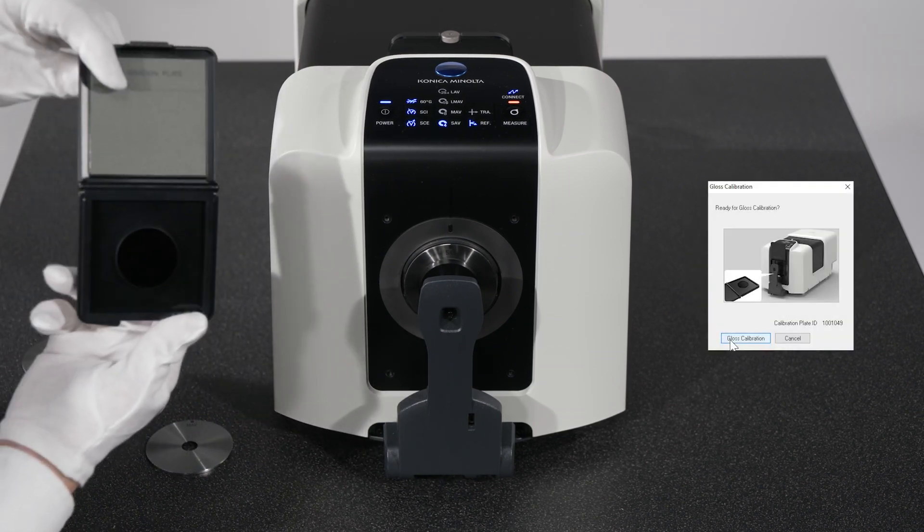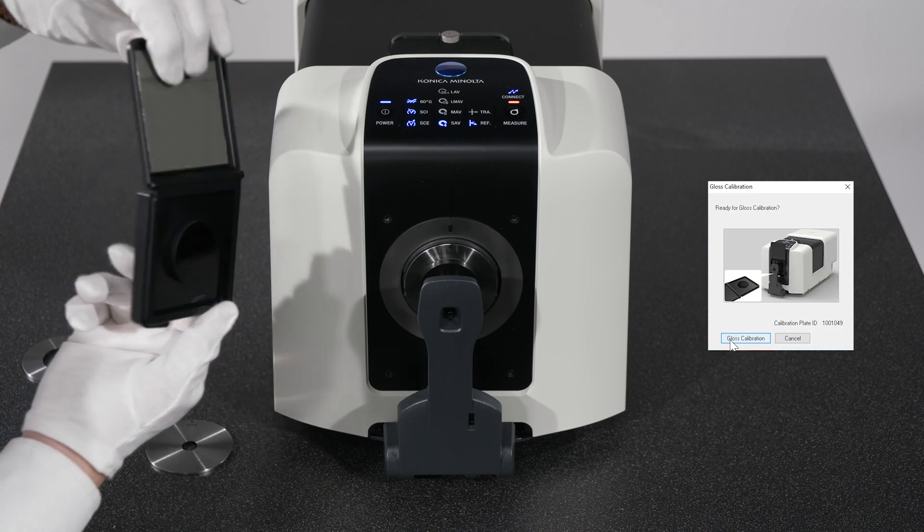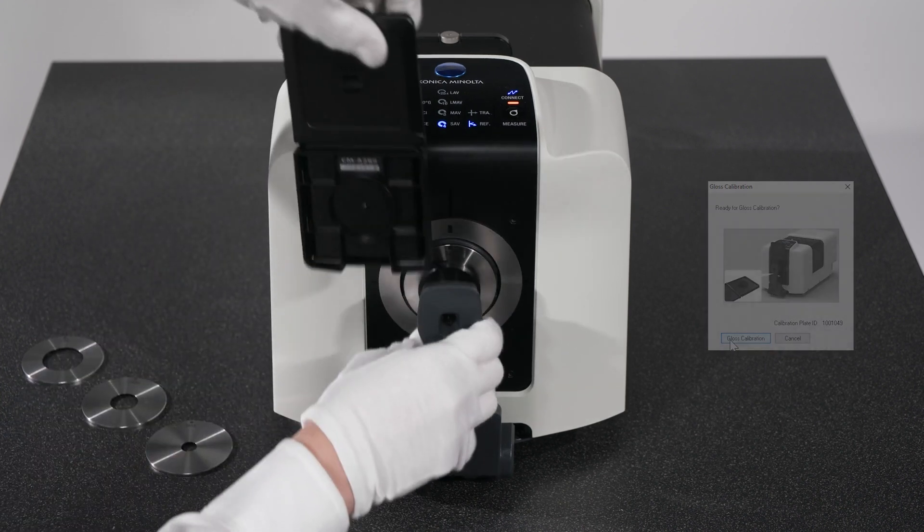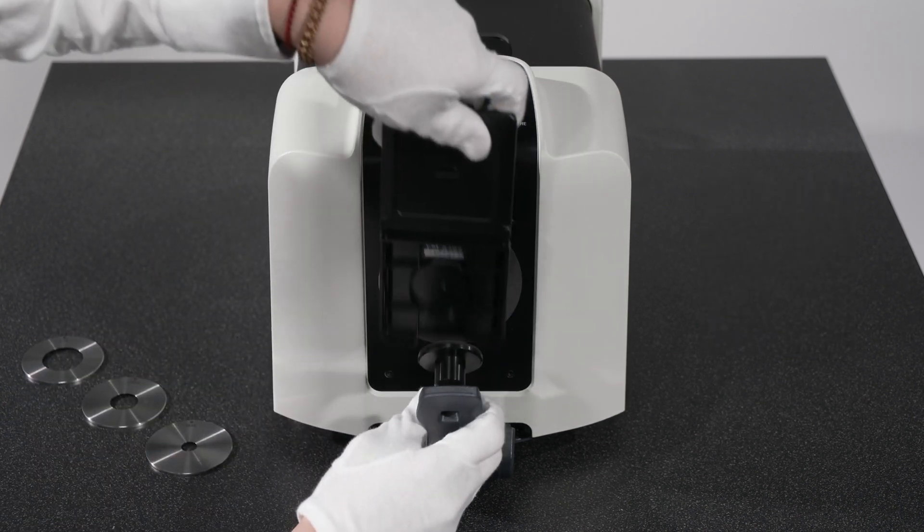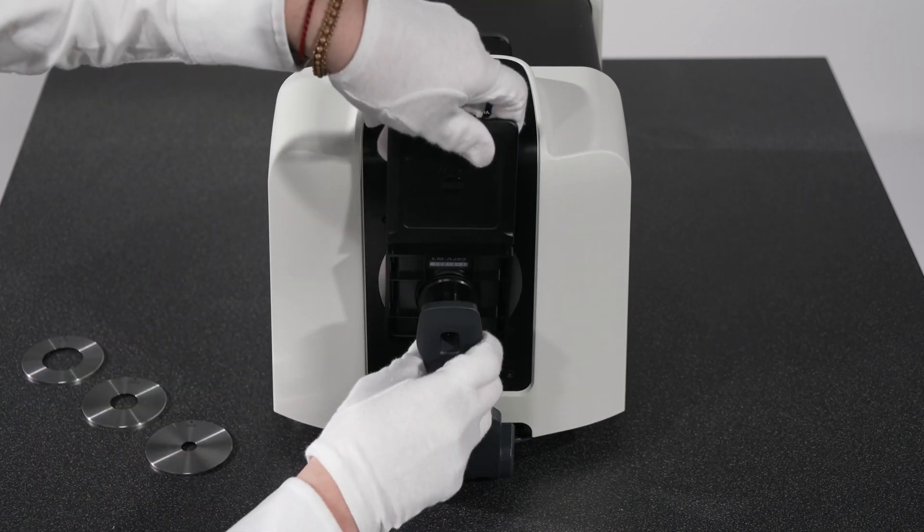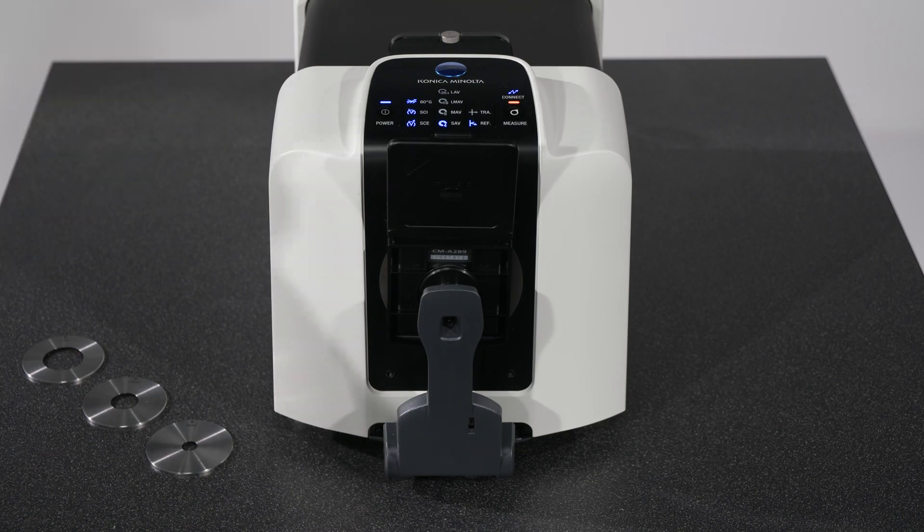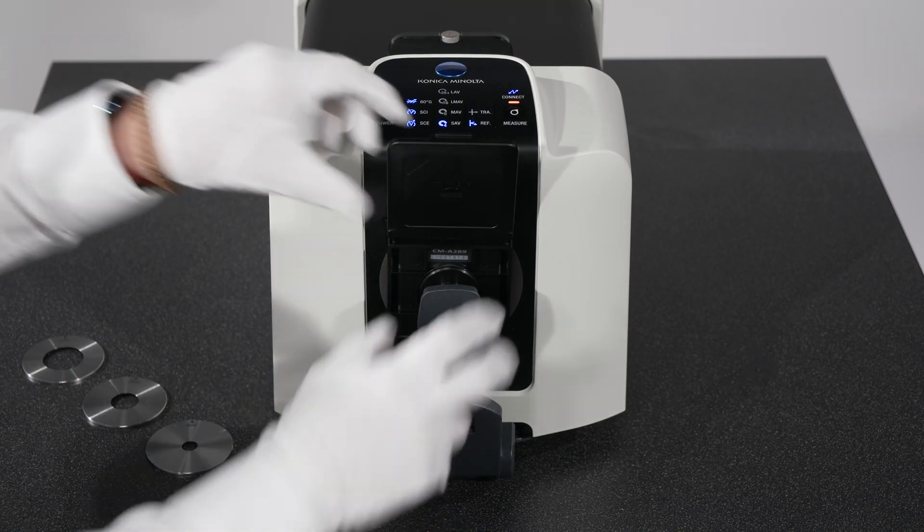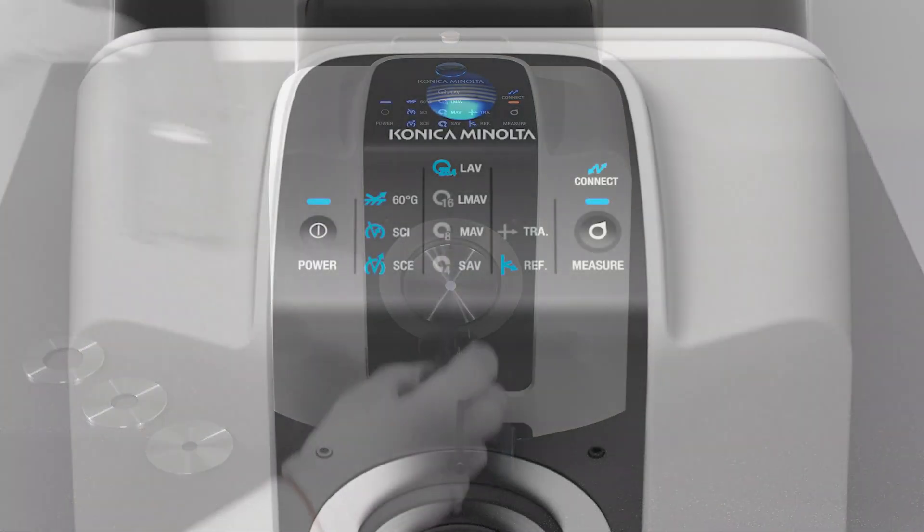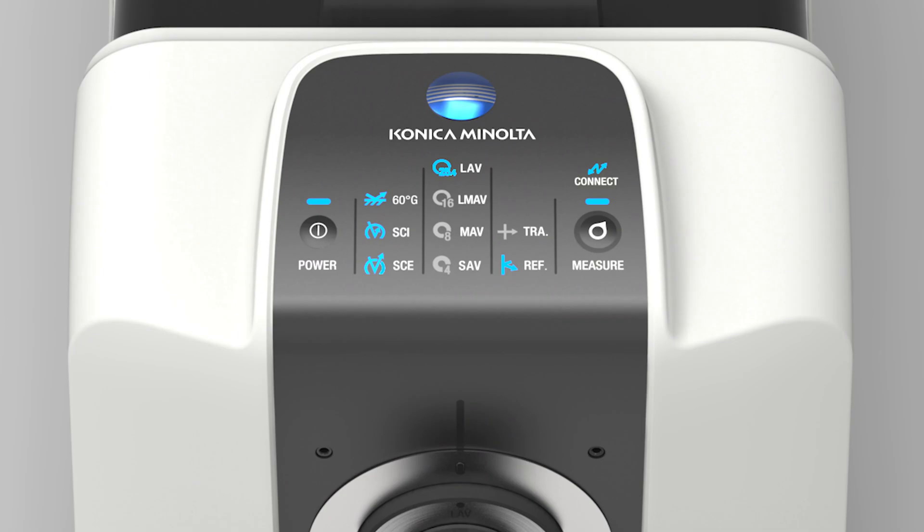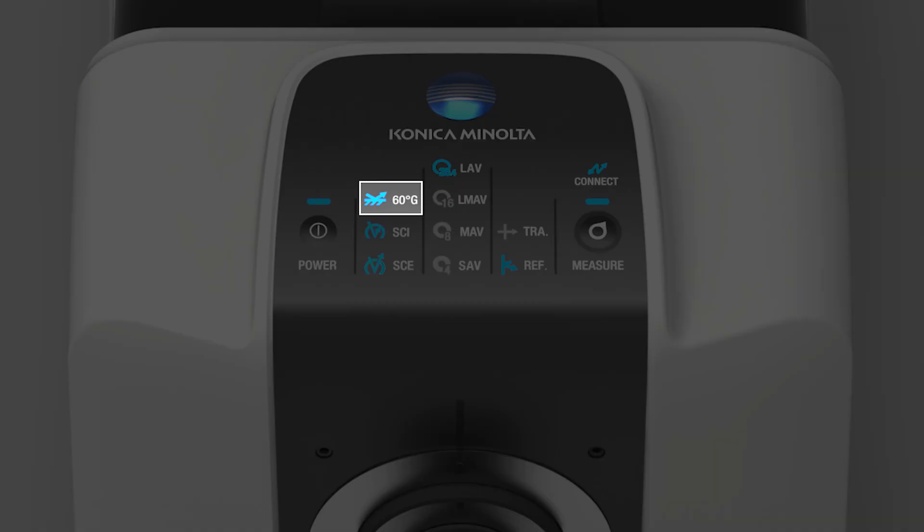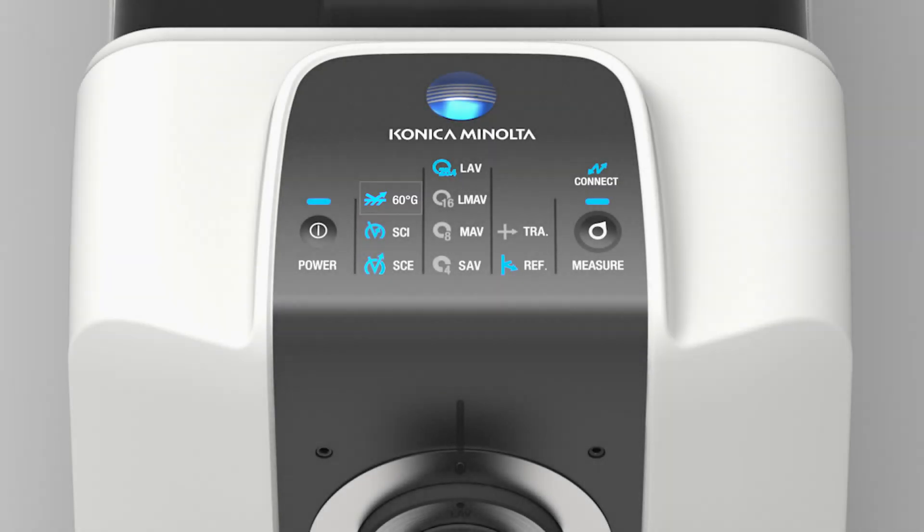When White Calibration is finished, follow the prompt for the Gloss Calibration. Position the Gloss Standard, then click to start calibration. When the calibration is finished, you will see the 60-degree gloss symbol light up on the display panel, indicating the gloss unit is calibrated. A blue light over the Measure button will also indicate the Zero and White calibrations were performed.